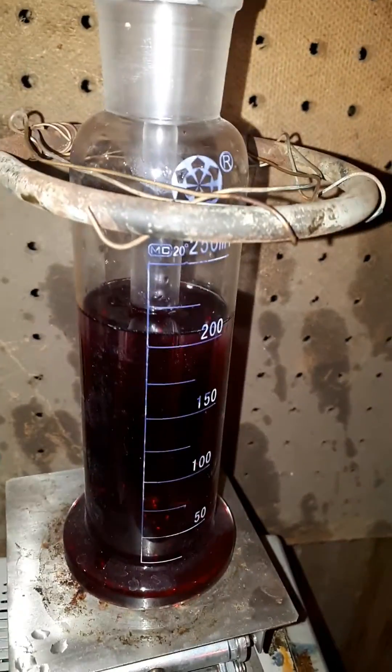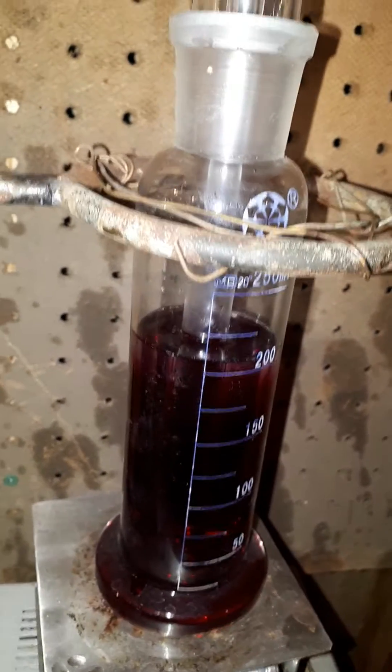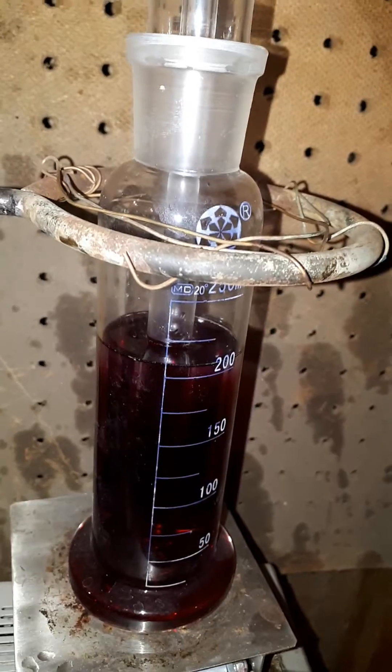It's going to the air bubbler, but nothing is coming out of the gas bubbler, so I'm just preparing.